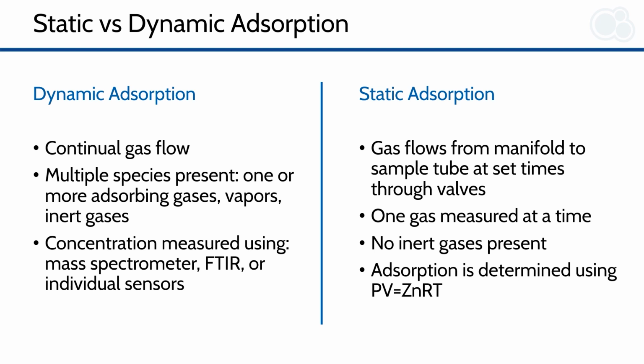In a lot of cases, dynamic adsorption is the next step after you've finished characterizing your materials, to assess the adsorption performance in conditions that are more similar to what you'd find in an industrial process.